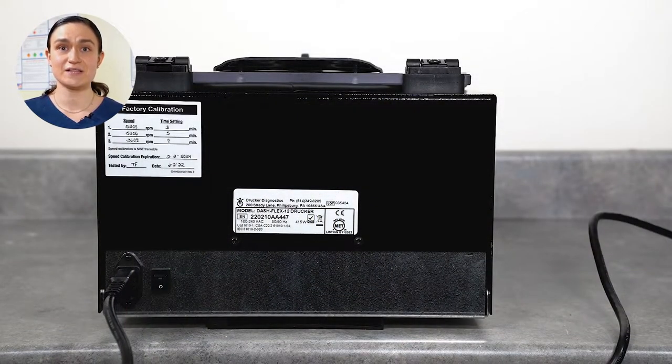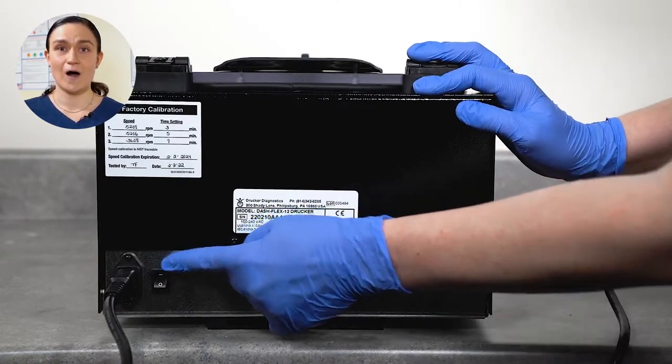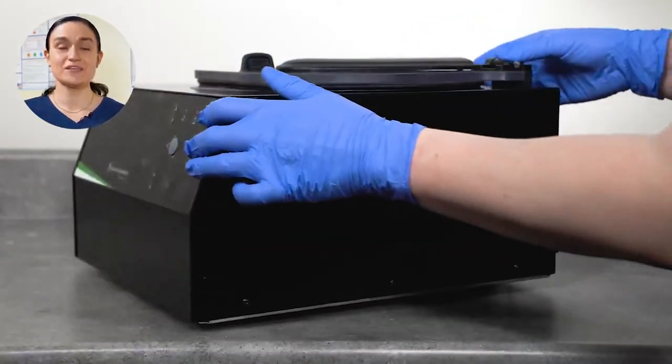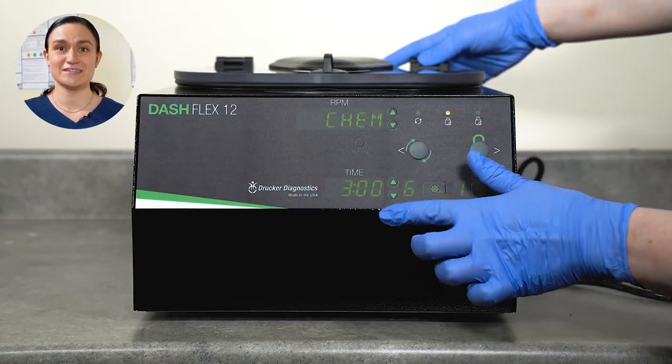With your centrifuge plugged in, look at the back of the centrifuge again and locate the power switch. Switch this on. Now, when you turn your centrifuge around, you should see the displays illuminated. Your centrifuge is set up and ready for your first cycle.